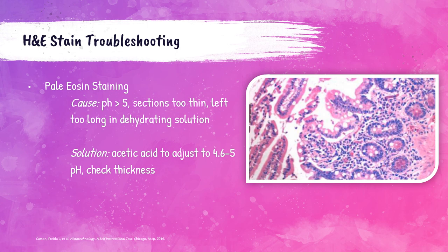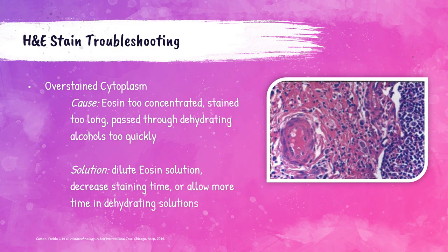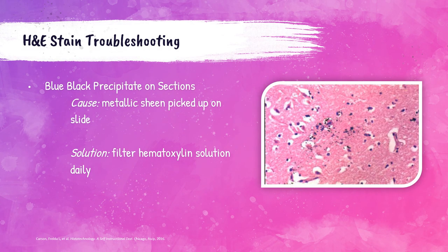Pale eosin staining can be caused by the pH being greater than 5, the section left too long in dehydrating solution, or the tissue section being too thin. If caused by a pH issue, add acetic acid to reach pH 4.6 to 5, and ensure the bluing agent is fully removed before transferring to the eosin stain. Overstained cytoplasm can be attributed to eosin being too concentrated, the tissue stained for too long, or insufficient time in dehydrating alcohols. Solutions include diluting the eosin, decreasing staining time, or allowing more time in dehydrating solutions.